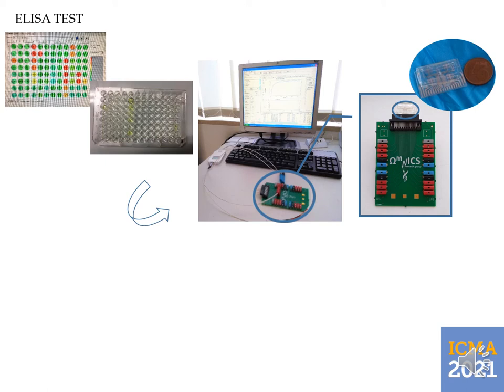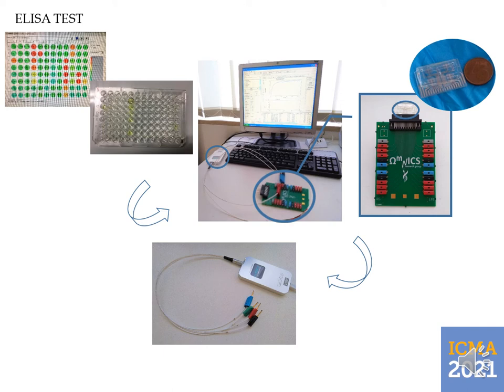In fact, interdigitated electrodes undergo a functionalization process which allows them to specifically bind the virus through a self-assembled monolayer that recognizes its antibody, the same employed for the ELISA test. Finally, the platform communicates the eventual biorecognition to the potentiostat, applying a sinusoidal voltage of 10 mV in the presence of a redox-coupled solution. The results can be detected immediately on the PC.